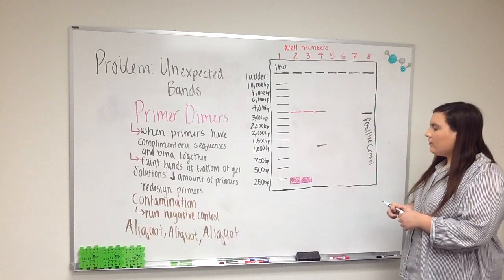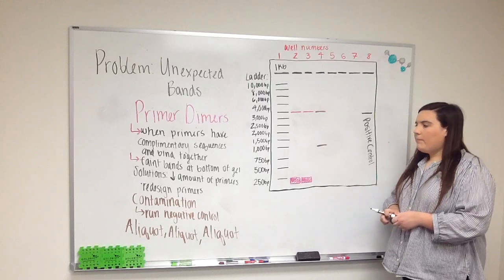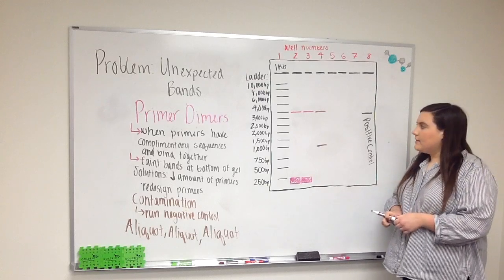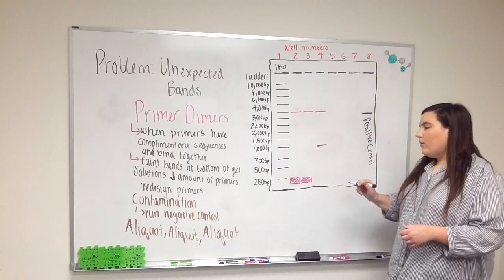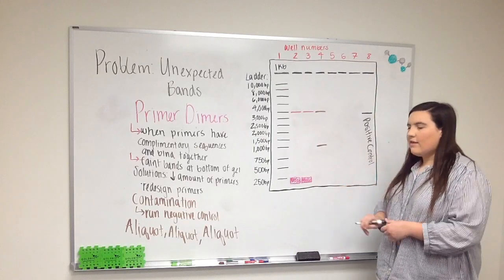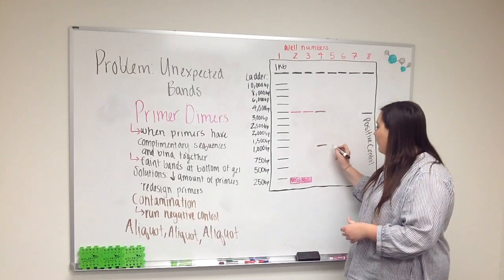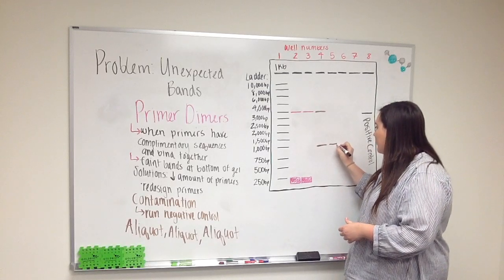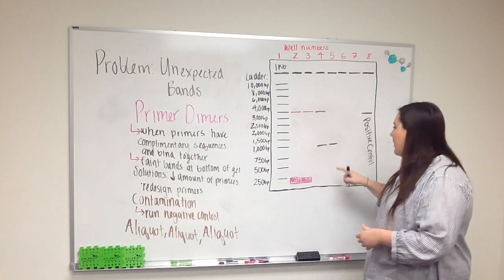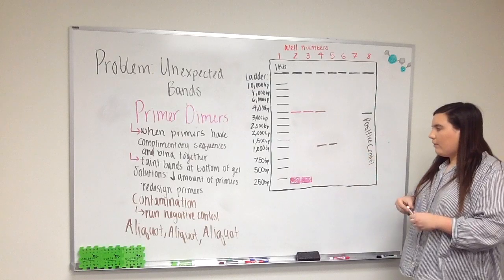How to diagnose this problem would be to run a negative control. You can run a negative control by using water instead of template DNA. If you have contamination in your reagents, meaning you already have some DNA that you weren't looking to amplify in the reagents, then you will run that sample that just contained water and it'll appear in the same spot that you had contamination in your other sample.